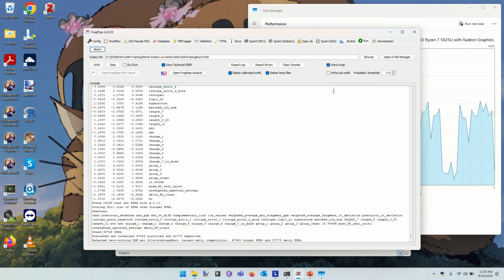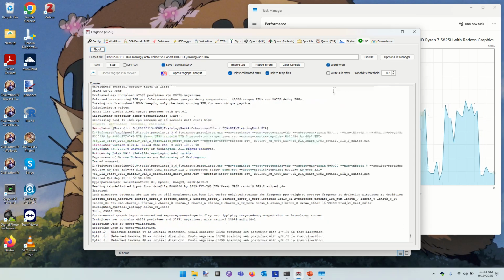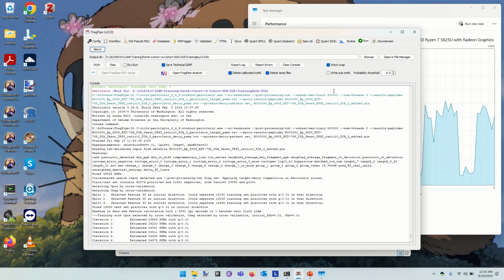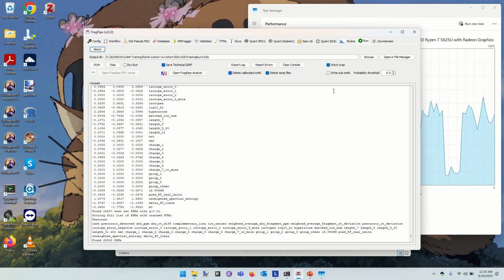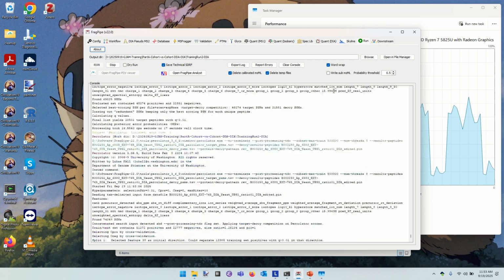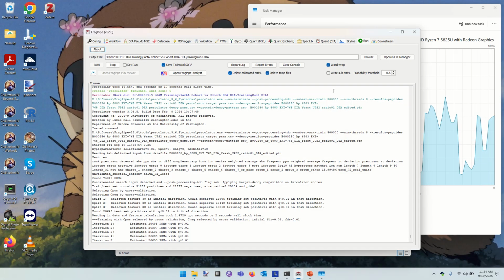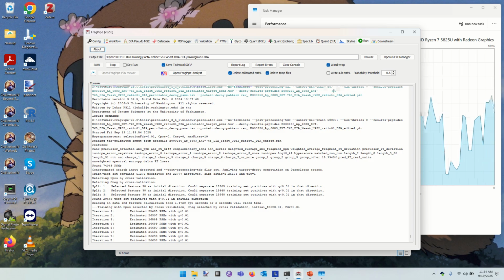But that's all one ion that we're evaluating, or at best, we see the same peptide at multiple charges that have several isotopes of it. Maybe we combined information from all of those, but that's a fairly limited base of information for building your quantity upon. DIA is very powerful because it allows us to quantify not just on the basis of intact peptides, but on the basis of the fragments that result from them. We have a chromatogram for the precursors, just as before, but we also have chromatograms for fragments. That's a broader, more stable base of information for us to base our quantity of this peptide on.